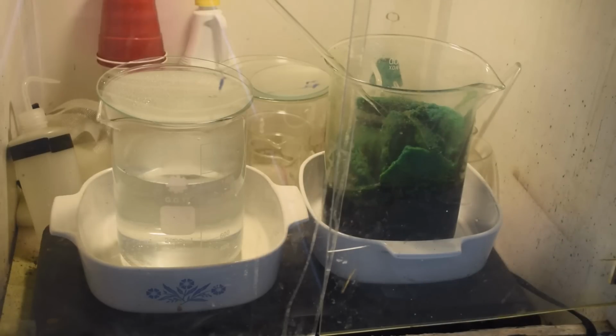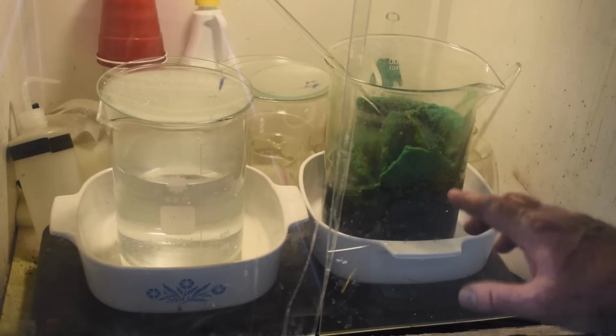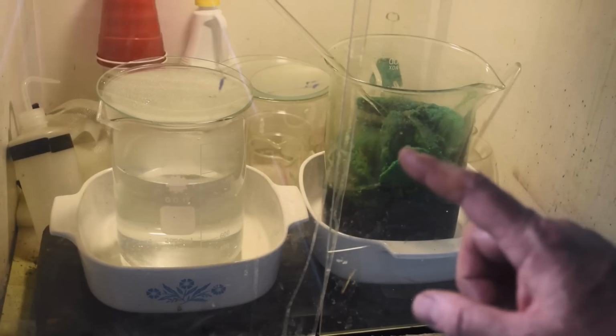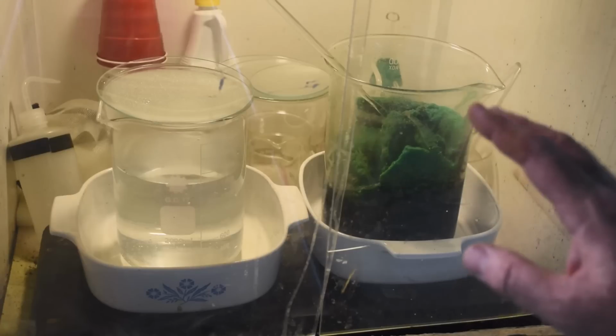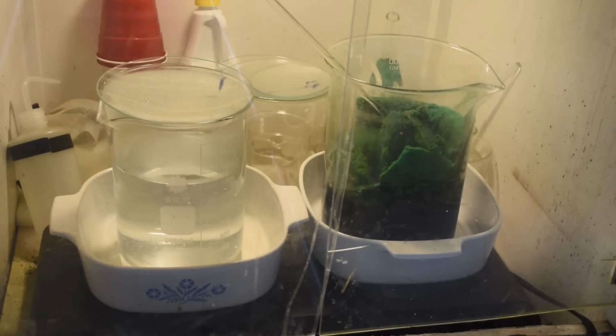The palladium chloride should not be soluble. And as the amount of hydrogen chloride in here goes down, the palladium chloride should drop out of solution. That's my theory. We'll see. I'm not going to be too quick to dispose of any liquid that comes out of here. It'll probably all go in my temporary stock pot just in case some palladium comes along. But we'll see how this works.